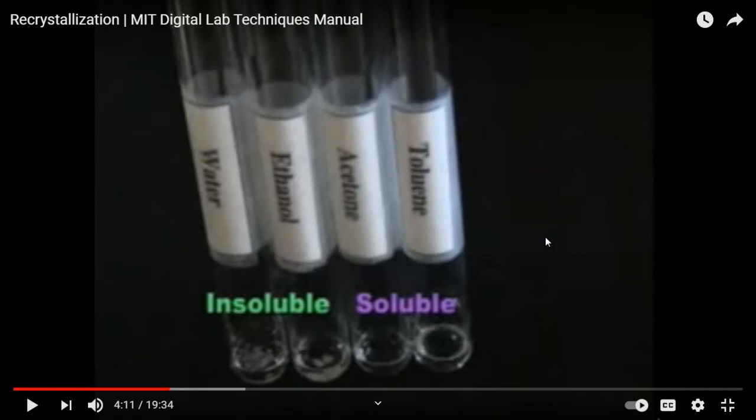How do you choose the right solvent? There are 2 stages. It should be not soluble at room temperature. That's what we're looking for. If something's soluble at room temperature, that solvent is not a good solvent.